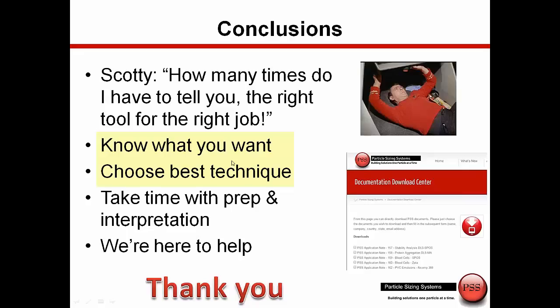Hopefully you can choose a technique and you're not locked into just what is in the lab. Be very careful when you're going to take that sample and come up with the sample preparation steps. Take your time. Investigate each step, such as sampling, dispersion, interpretation, because all of these are going to have a great influence on your result and for anyone else to be able to repeat the results that you're creating the method for.